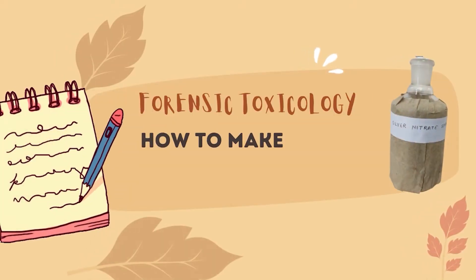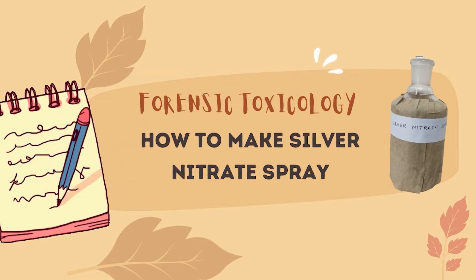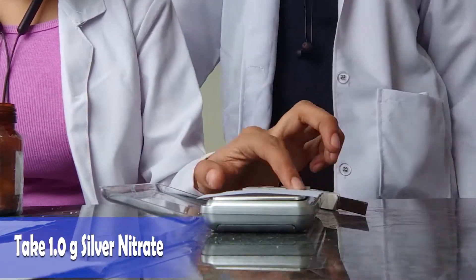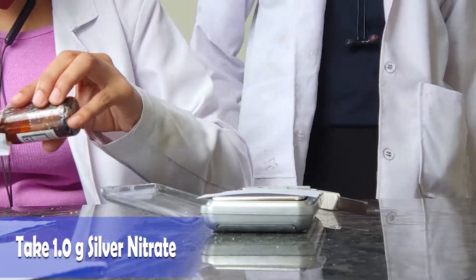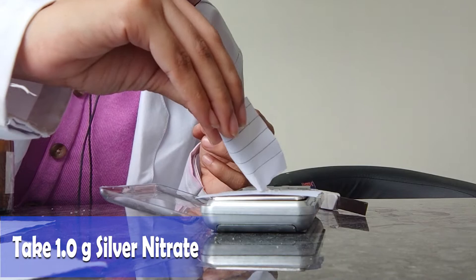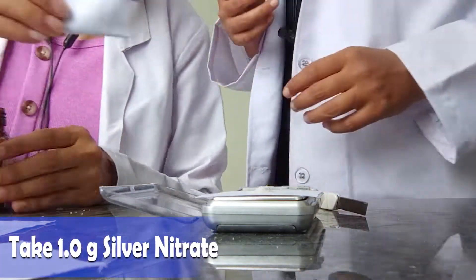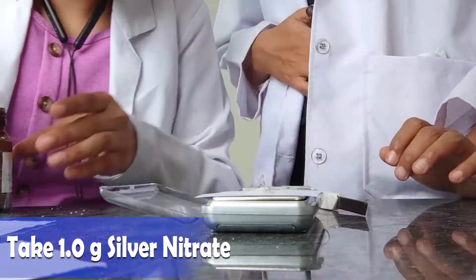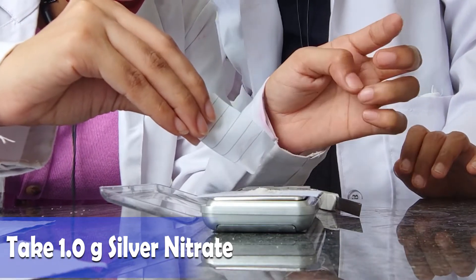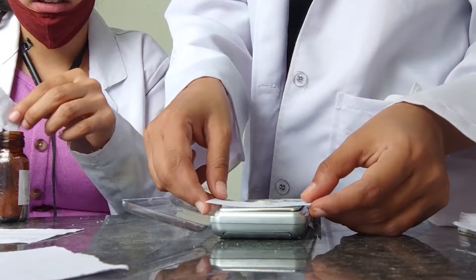Today we will see how to make silver nitrate spray. Step one: weigh one gram of silver nitrate on the weighing machine. Remember, after keeping paper on the weighing machine, do not forget to press the tare button so that the weight of the paper is not counted, and then put one gram of silver nitrate.